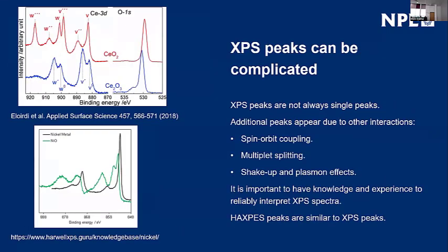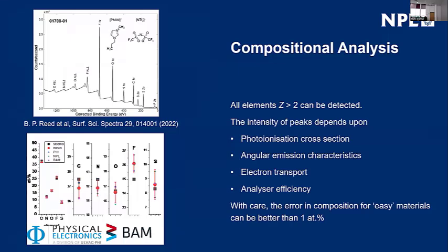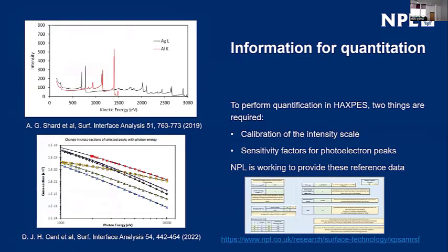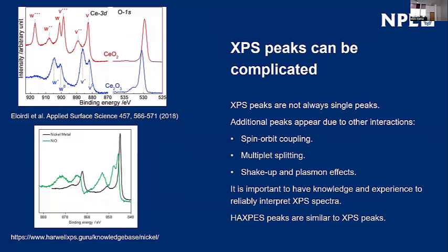Okay, I'm now about to run out of time. I'm going to just tell you this simple picture that I gave you before, pretty good for carbon, not good for other elements. And this is just an example of cerium oxide. You don't get one peak, you get 6. Now, there's 2 pairs of 3 really. And this is due to shake-ups.